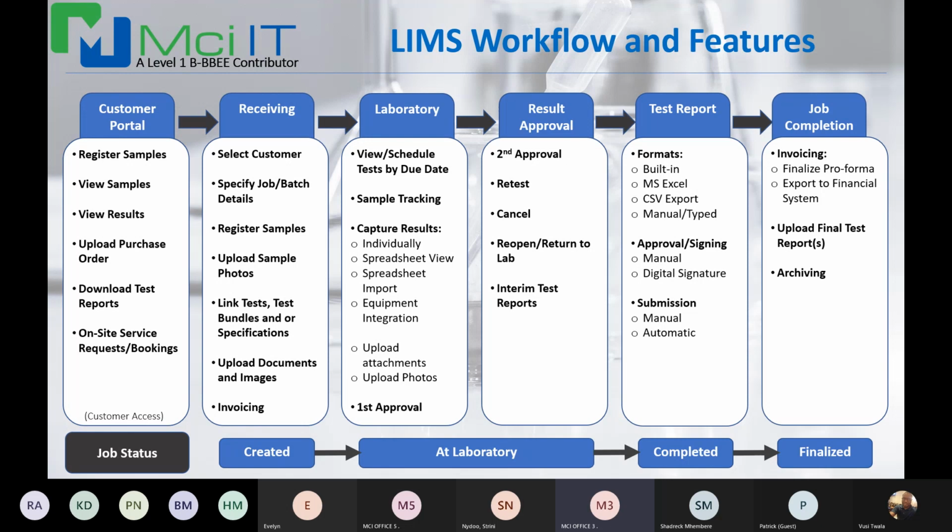It can be signed either manually, scanned and emailed, or via a digital signature platform, for which we provide a solution as well. Once the report has been issued, there's just the last step of finalizing that job or the batch, and the laboratory may need to finalize the invoicing. If there's financial system integration, they would export the invoice to the financial system, and they would upload the final test report back into the application, so that the application can recognize that batch as being completed, and it moves it on to the next stage.